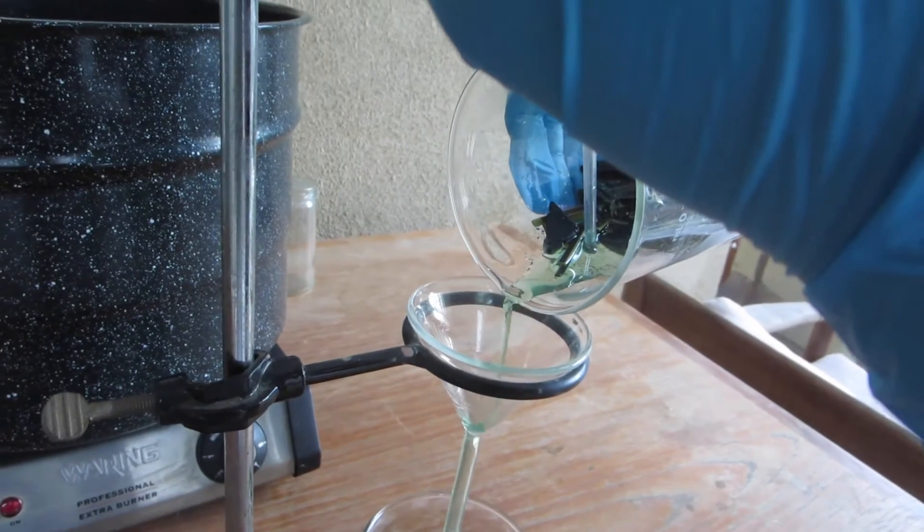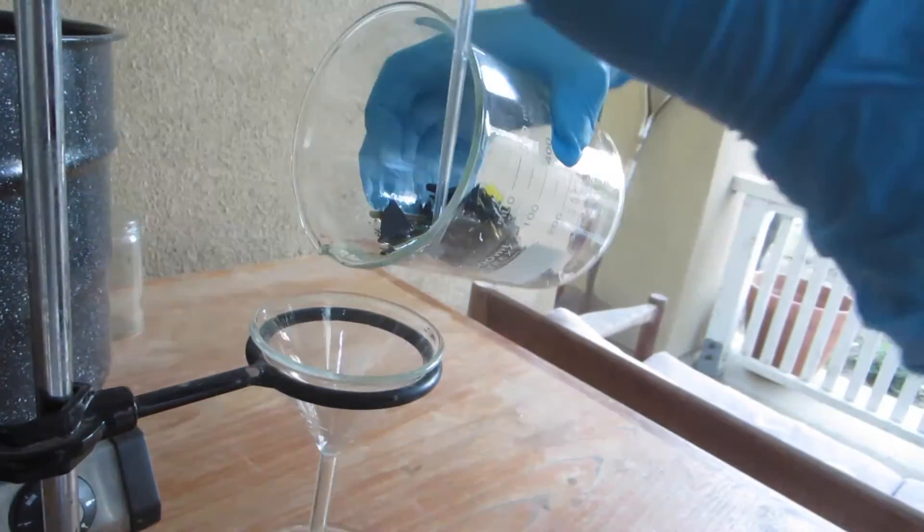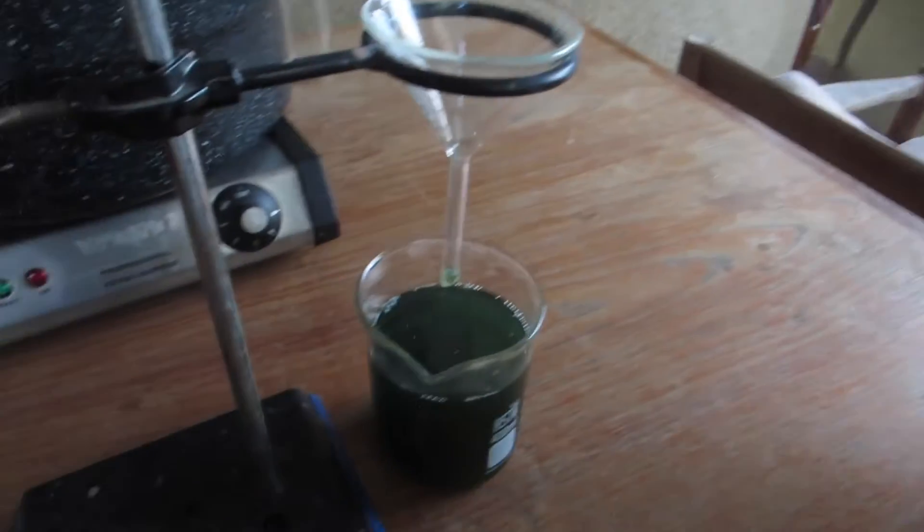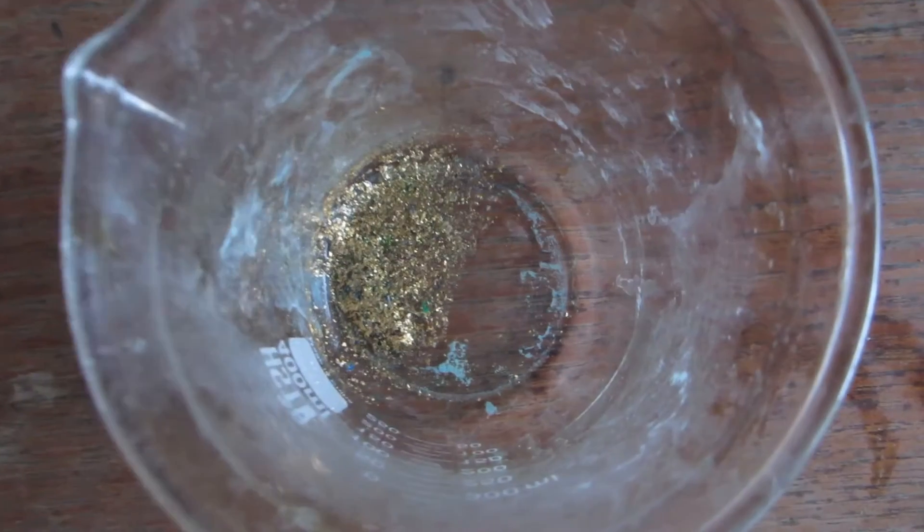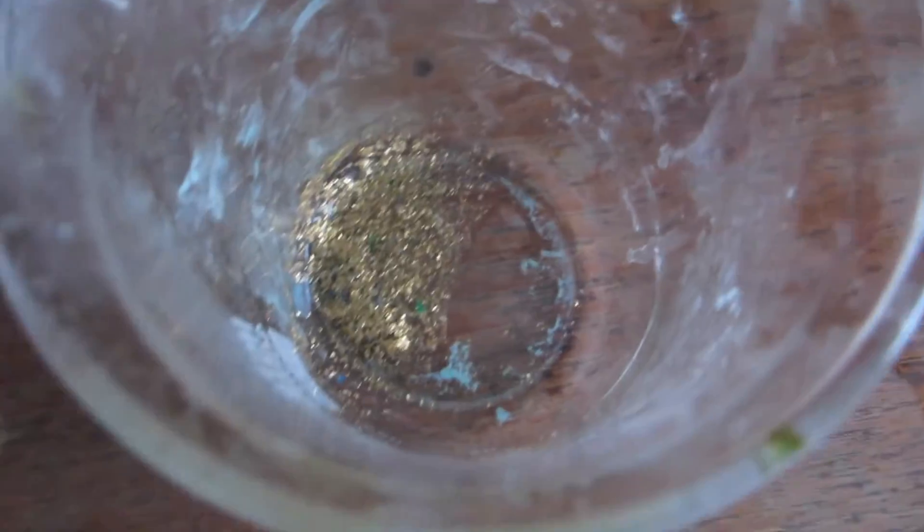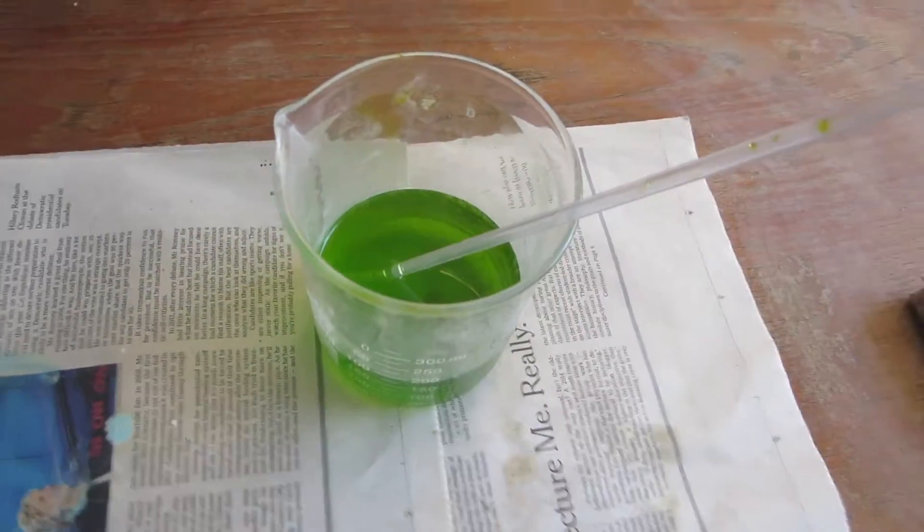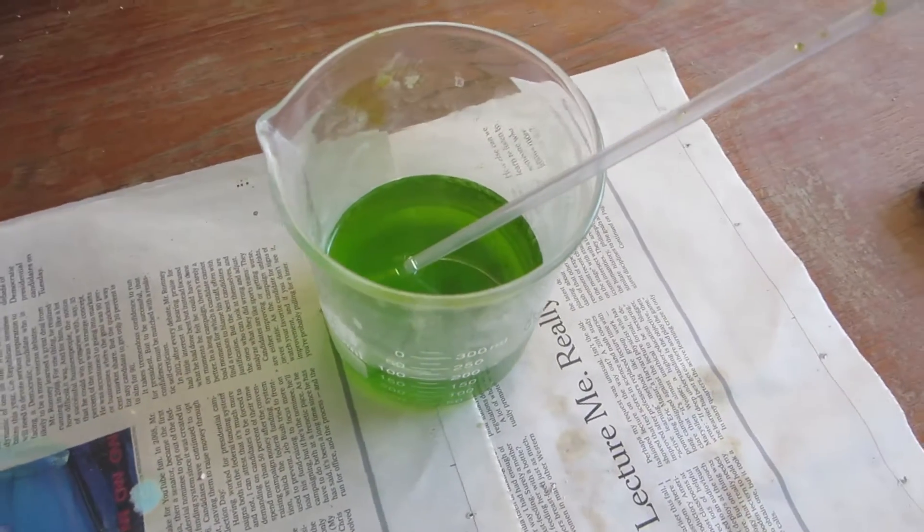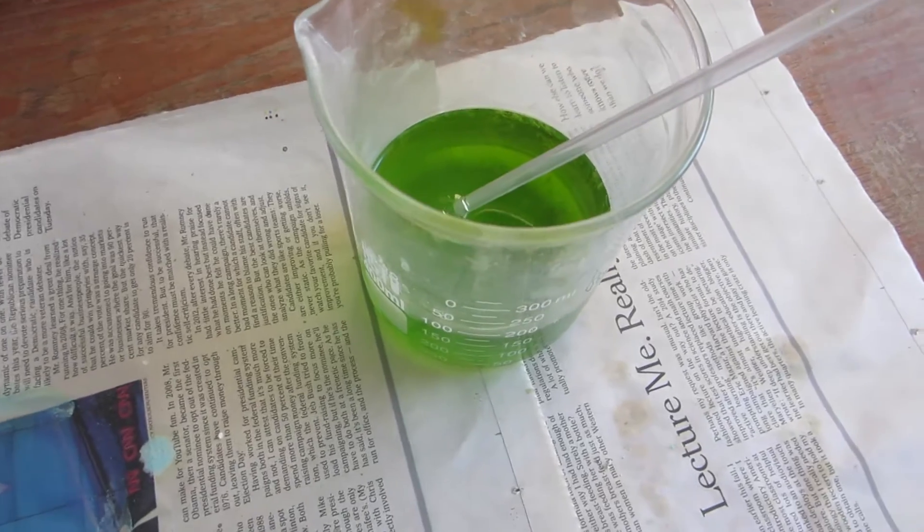I'm going to rinse all the rest out. After getting the water out, this is what the gold solution should look like after dissolving in hydrogen peroxide and hydrochloric acid. It's green from copper impurities.